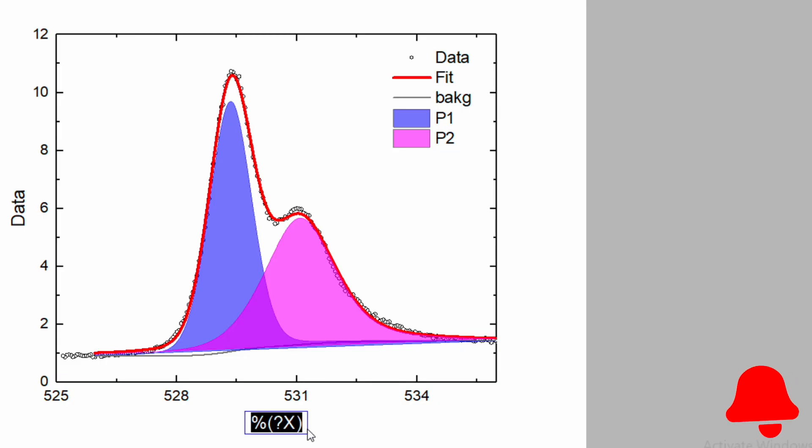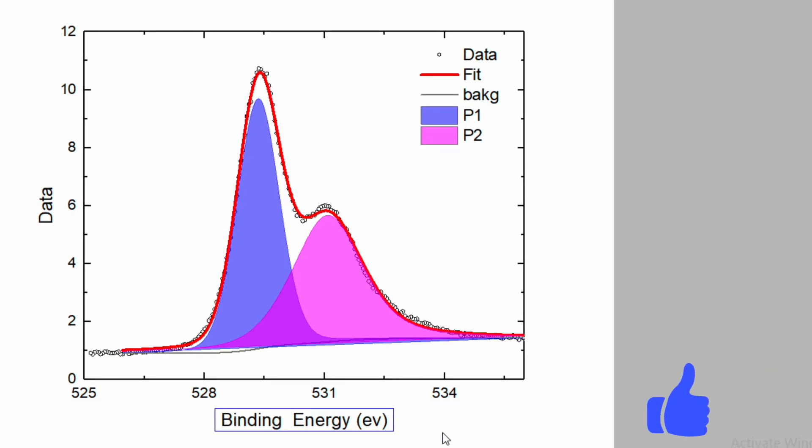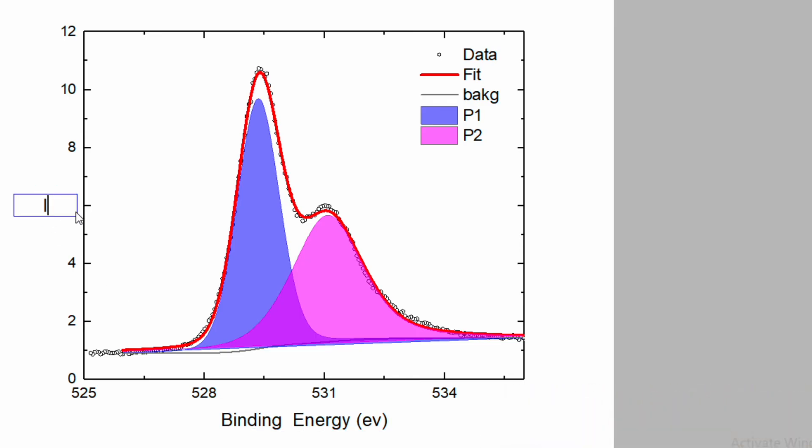X axis is binding energy and the unit is electron volt. And the y axis is intensity or count. Write down as a.u.